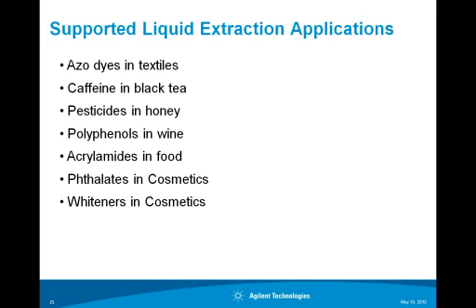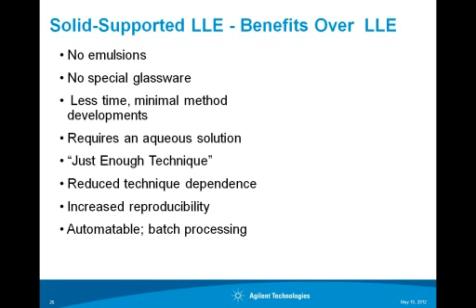Supported liquid extraction applications are very wide-ranging, anywhere from azo dyes in textiles, caffeine, pesticides in honey, polyphenols in wine, acrylamides in food, phthalates in cosmetics, and whiteners in cosmetics. The solid-supported liquid extraction has many benefits over liquid-liquid. First of all, no emulsions, no special glassware, less time, minimal method development. It does require an aqueous solution though, and that's something to keep in mind.